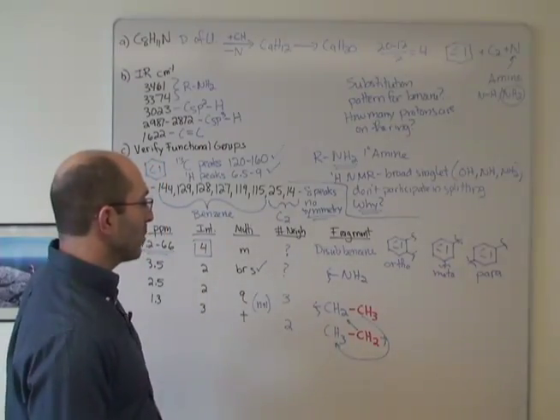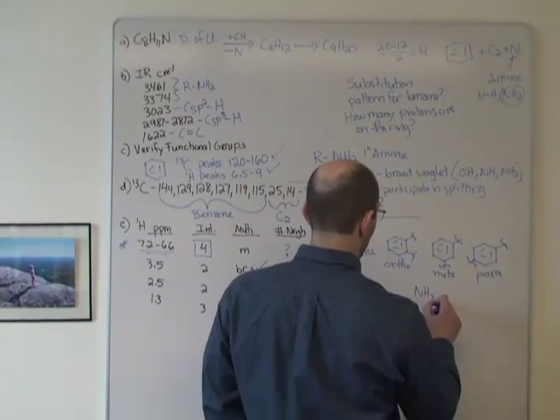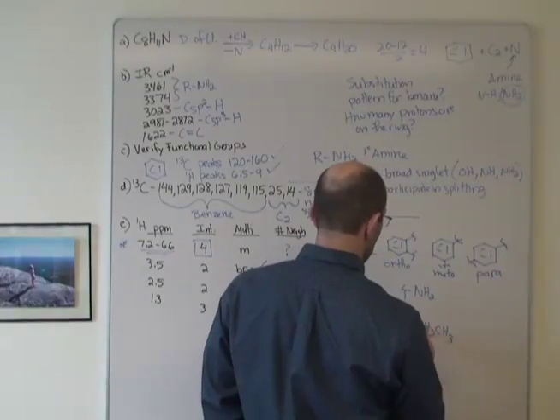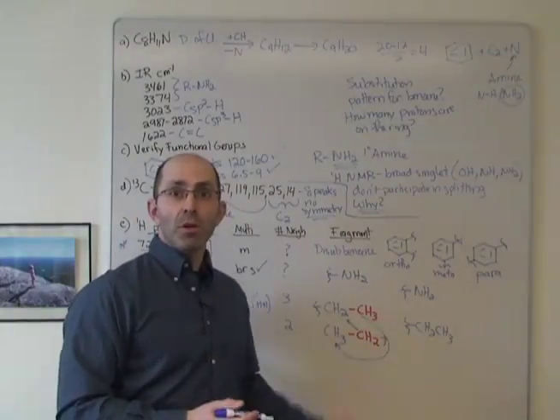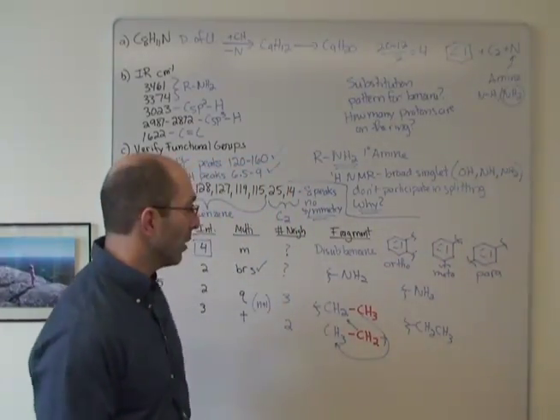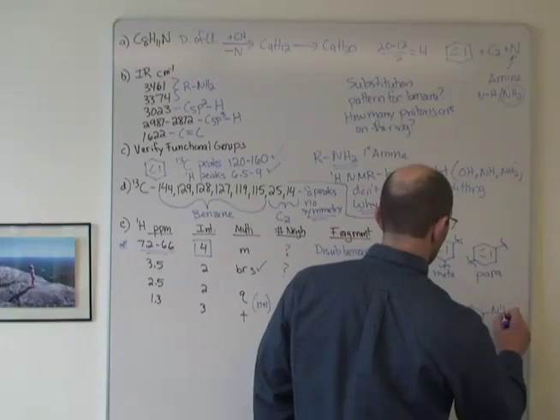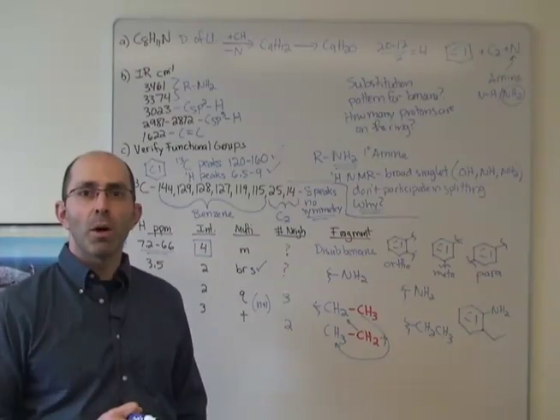So the fragments we have to bring together are something going on with this benzene ring, an NH2, and a CH2, CH3. So you have these 3 fragments. How are you going to put them together? I'm going to leave it for you to think about how you would pick one of these substitution patterns. I'm just going to randomly pick the ortho and say, if we know that it's a di-substituted benzene, there's a structure that's consistent with what we've been talking about.